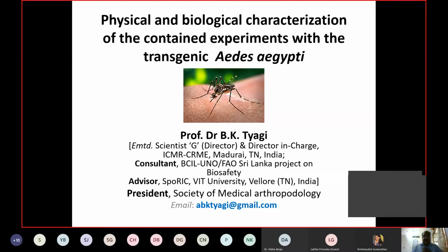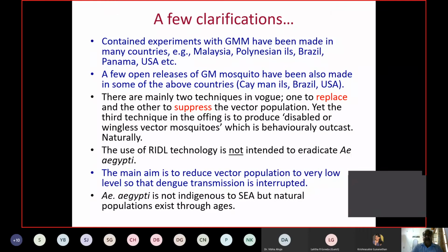Well, as we discussed yesterday, and Dr. Vibha also informed about the necessity to observe all the biosafety measures when we are experimenting with a mosquito like Aedes aegypti, because it carries a very big risk when we do research with a mosquito like Aedes aegypti. So it's very important that we need to understand the principles behind the GM mosquitoes in our laboratories.